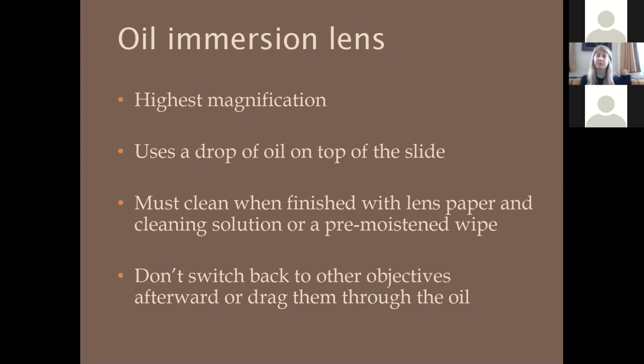You really need to clean that when you're finished because that oil gets sticky and it can muck up the lens. So every time when you're done using that, you do need to clean that with a piece of lens paper. Now I have a slide coming up that shows you what that lens paper comes in. And I use alcohol for that, or they have cleaning solutions for that as well. So you just put a little bit of it onto these wipes and then rub it across, or maybe kind of stick it up in there a little bit if needed.